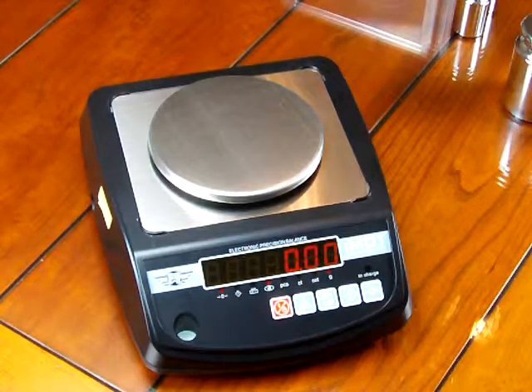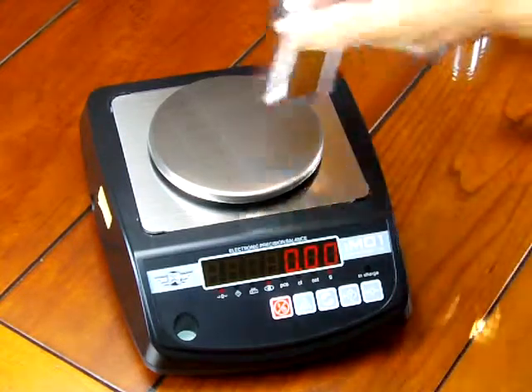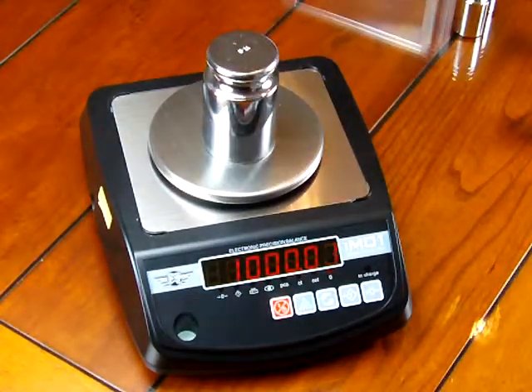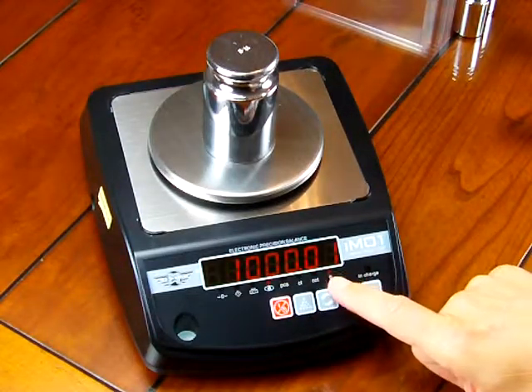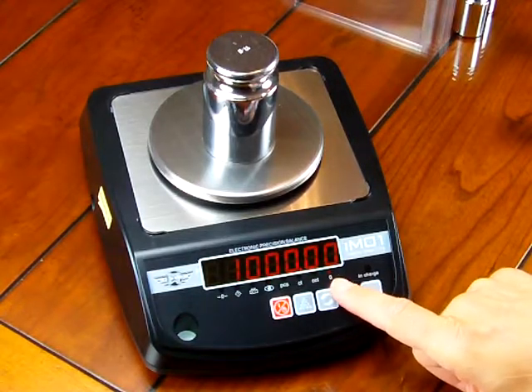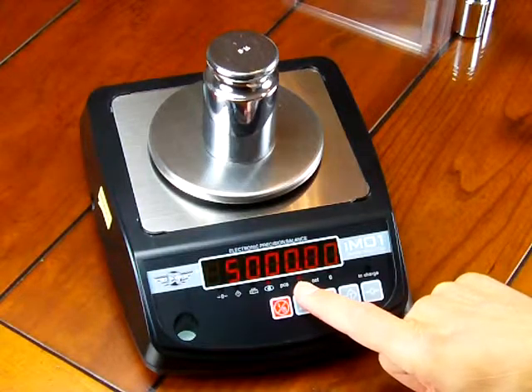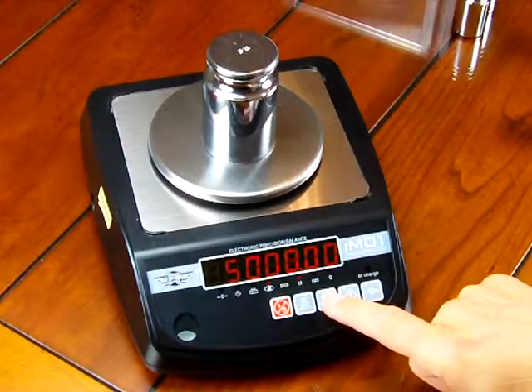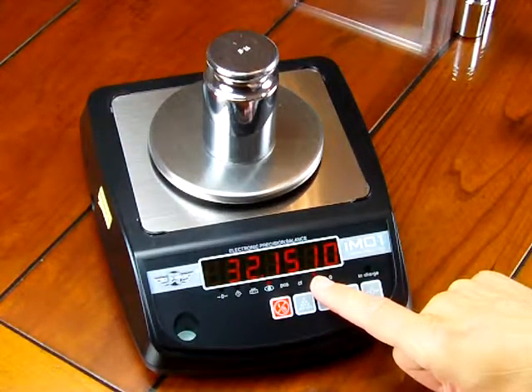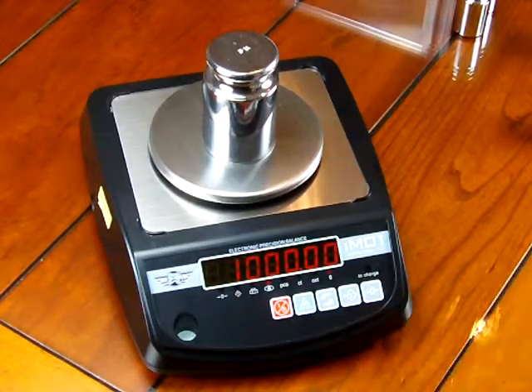We hope this video was informative. Just before I close out, I want to show you one more thing about this scale. This scale has three weigh modes. Simply by pressing the middle key, you'll notice the light is highlighting G for grams. Press the key once and now you're in carats — there are five carats to a gram, so I'm showing 5,000 carats. Press the button again and we're in ounces. So we have three weigh modes, and pressing again brings us back to grams.